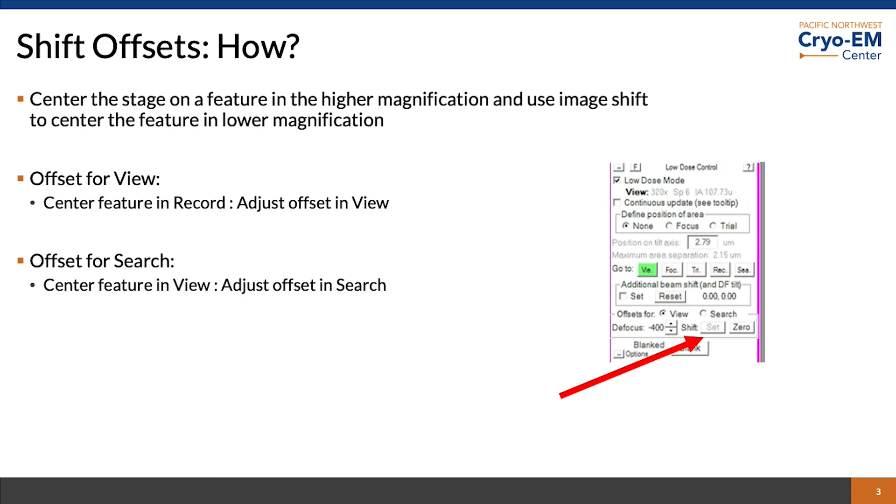Once you have the feature correctly centered in view or search, depending on your goals, you look in the low dose control panel and click set under shift offsets for view, or click the search radio button for offsets for search. Once that's complete, you can test it out.